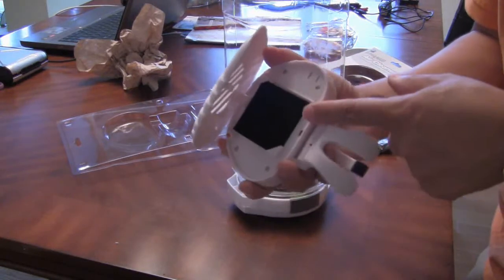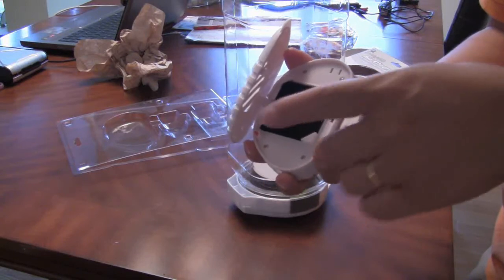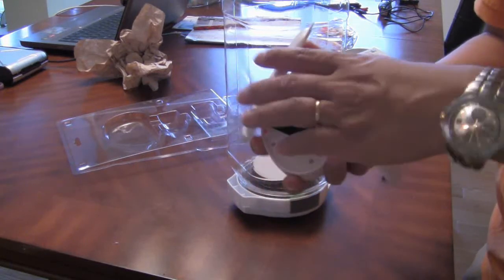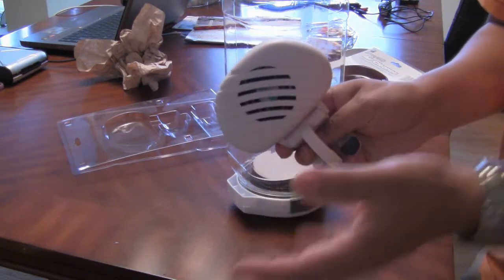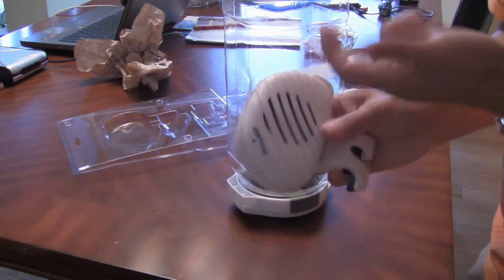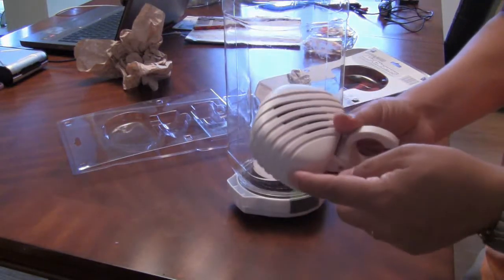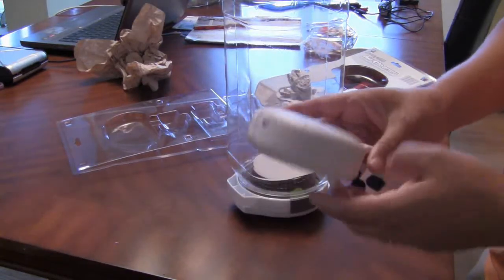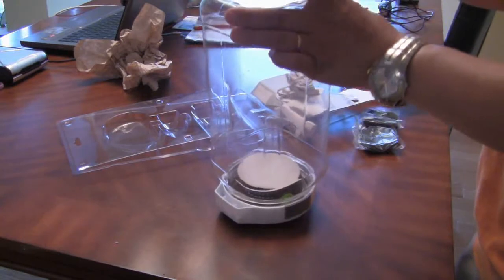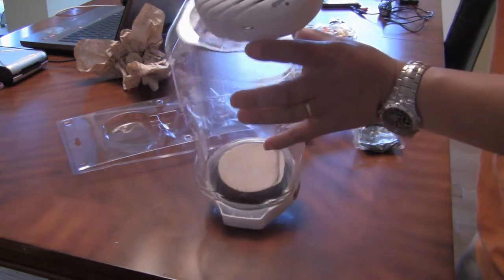Again, the reaction should only be a couple of grams of chemical so that this filter system can handle it. There's a fan here that pulls air through the filter. It comes with an AC plug so you can plug it into an AC outlet. I'm going to drill a hole and place the air cleaner system on top of the reaction chamber.